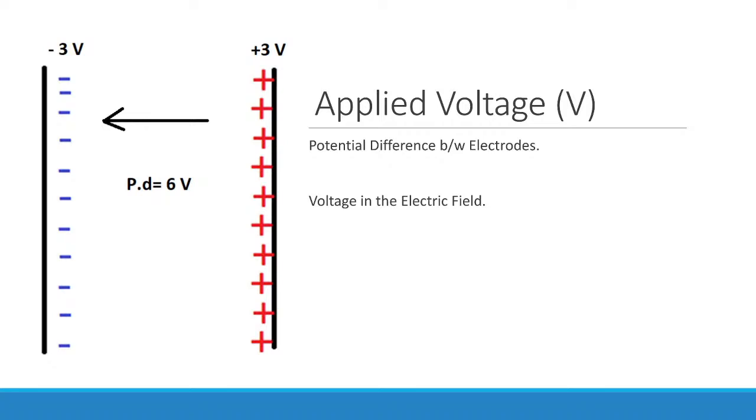This makes the trajectory go into a specified direction because of opposing charges, or rather, it could be charged from the spinneret and the collector could be grounded. In any case, in both cases, there's a potential difference, and the charge has a formed path that it needs to go to, essentially.